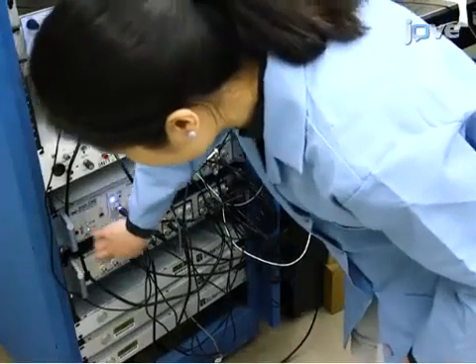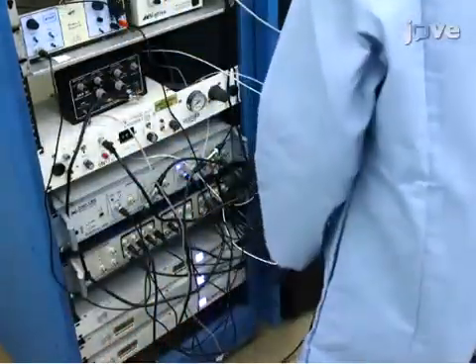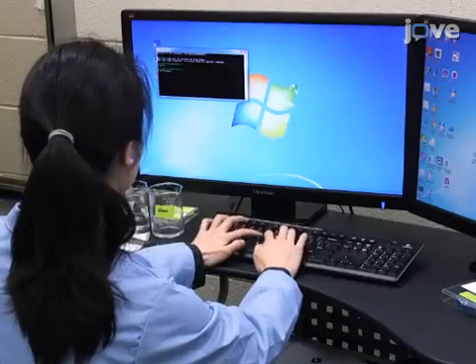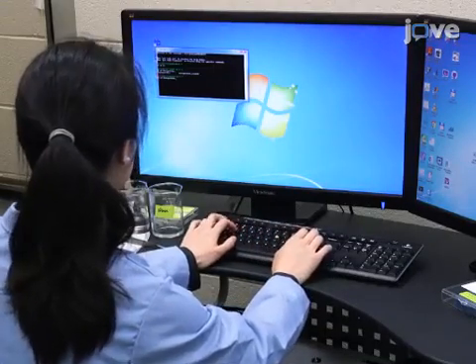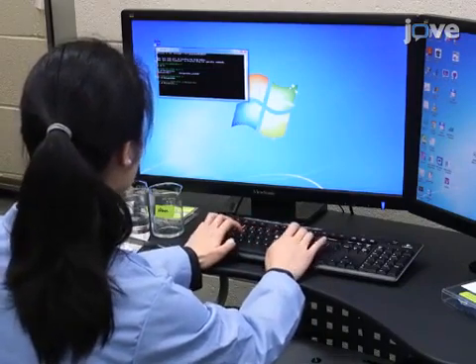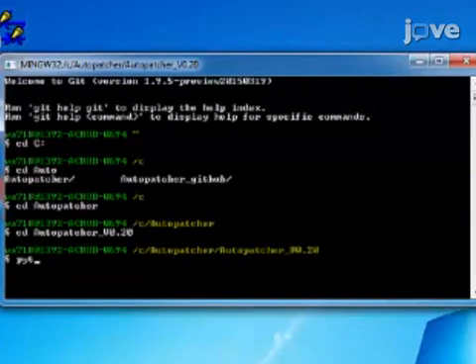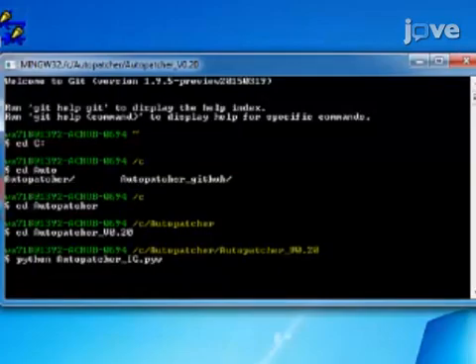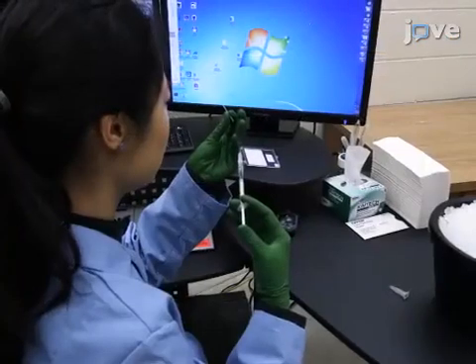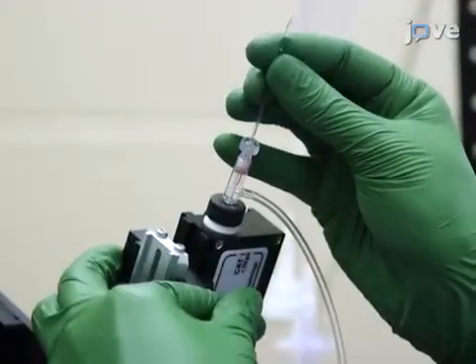To begin this procedure, turn on the amplifier, microscope controller, and the manipulator controller. Then, run Autopatcher IG with Python from a command line terminal by first changing the directory where Autopatcher IG is installed. Next, type python autopatcher_ig.pyw in the command line terminal and hit the enter key. After that, fill a pulled glass pipette with internal solution and load it onto the head stage.